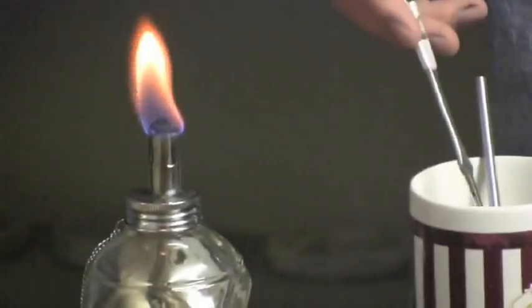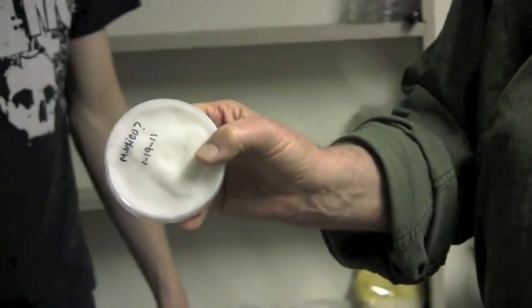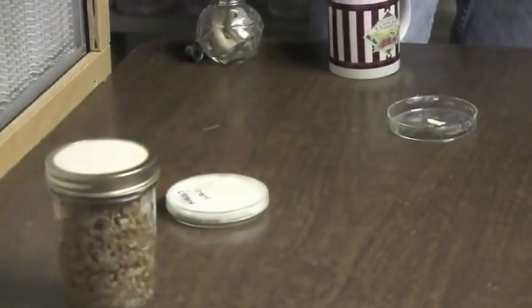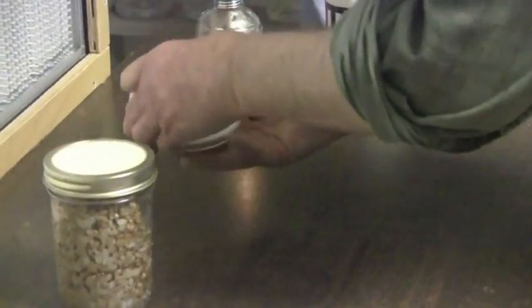I think we've got 18 jars that we've done today in this process. Sterilizing the scalpel, opening a new petri dish, keeping it right in front of the laminar flow hood so the air is clean and sterile.